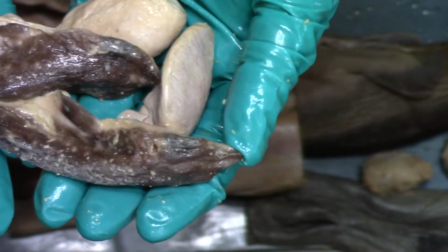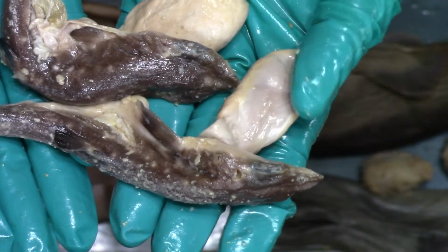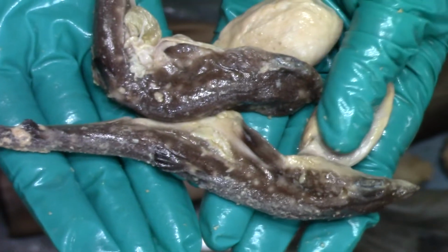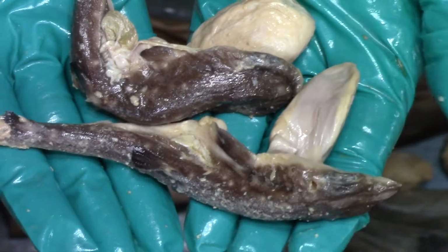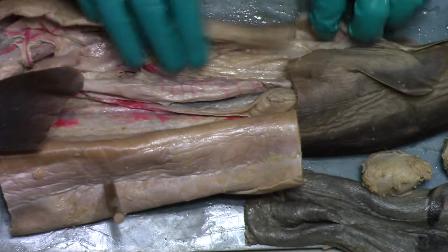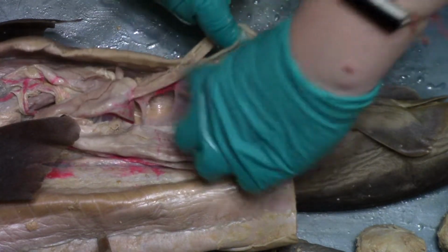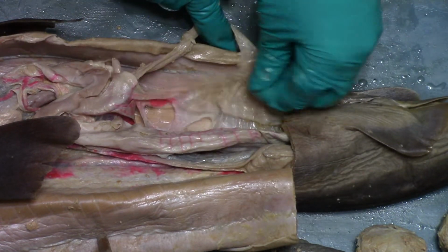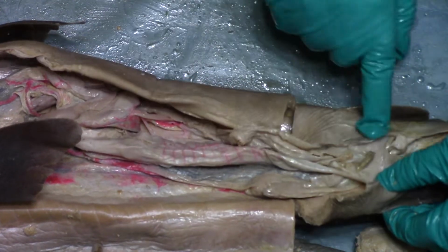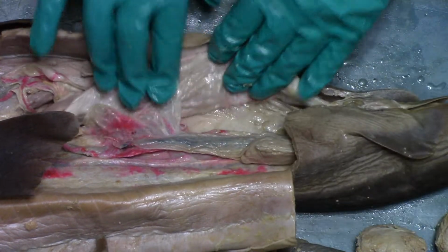Like you can still see the gills in the mouth and the eyes. All the fins look pretty good. Getting close. And the formaldehyde sort of plasticizes all the materials, but the eggs wouldn't be quite so hard. Like they're thinking like a much softer yolk sac. So that is our, which way do I need to put that? So this is our uterus here that we just pulled those babies out of. And it goes all the way down through the cloaca and would get birthed out here. So there's some on this side too.